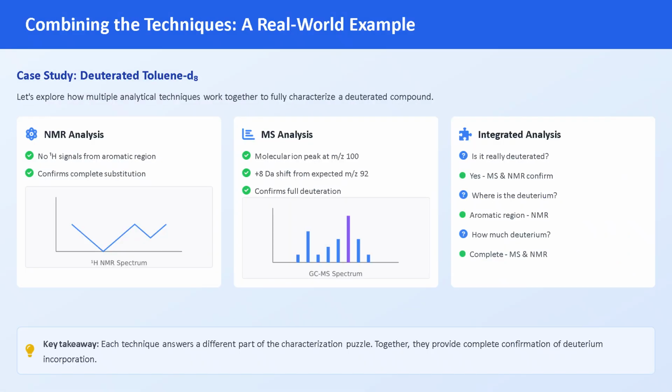When compounds aren't GC-friendly, polar, large or thermally labile molecules, LCMS is the technique of choice. LC separates your components gently, and MS detects the mass shifts down to 1 Da with high-resolution instruments. Combined with fragmentation data, LC-MS can tell you not just whether deuterium is present, but whether it's retained through processing or metabolism. That makes LC-MS especially useful in drug metabolism studies and when monitoring deuterium retention in biological samples.